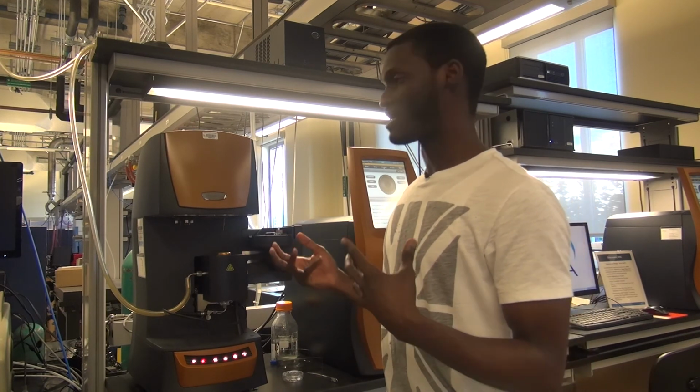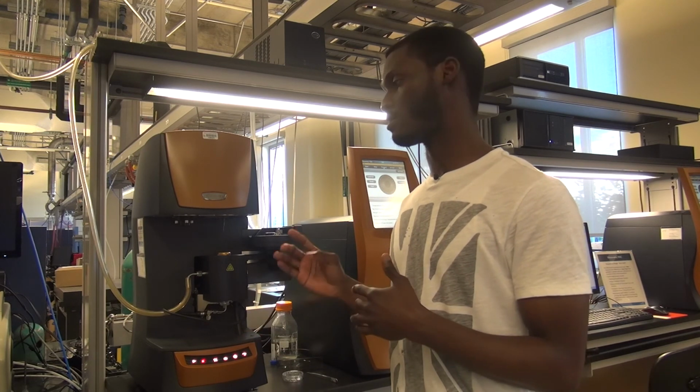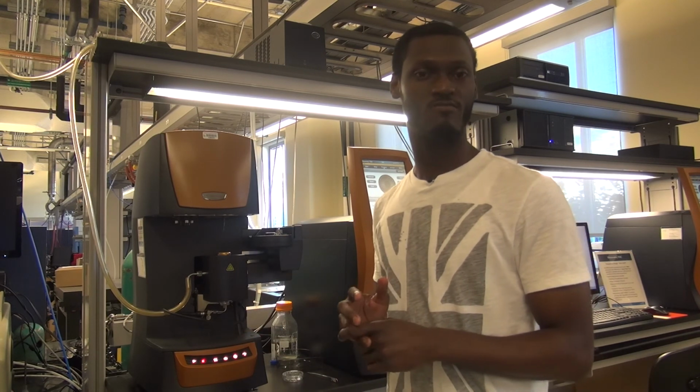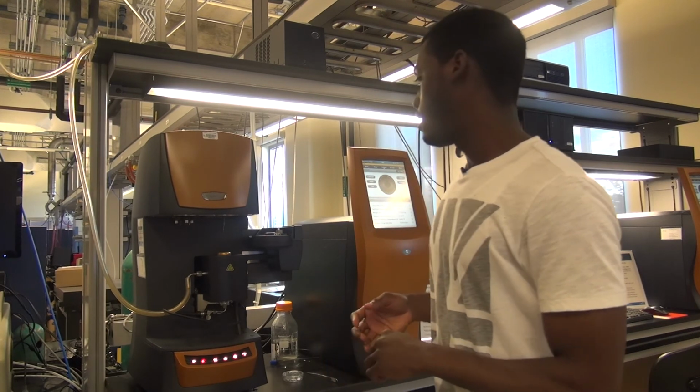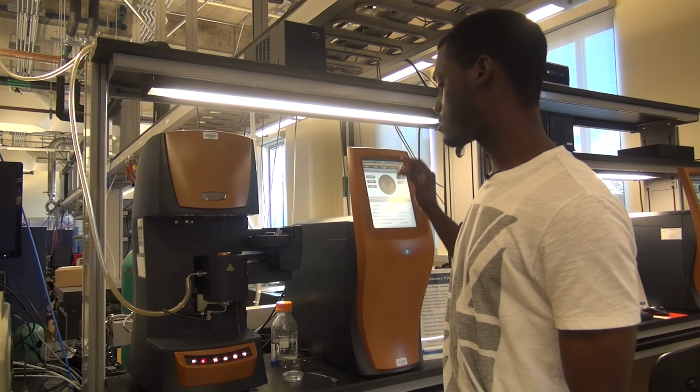Okay. Just remember, anything, again, that's in there can get on someone else's sample. So be courteous. Don't try to hide and say, oops, I didn't actually spill anything when you did. Just be honest and let us know so that we can accommodate and get things cleaned up for the next user. All right. So that's basically the mechanics of how you do things.